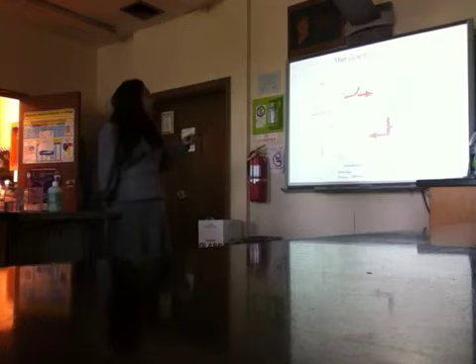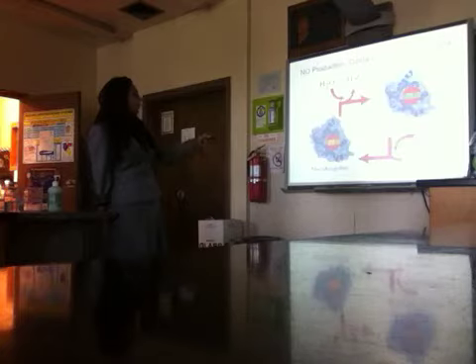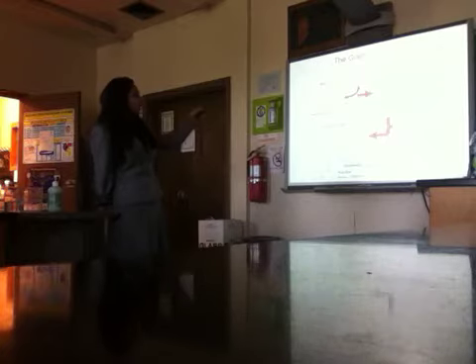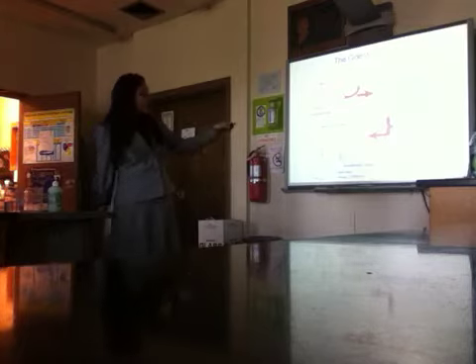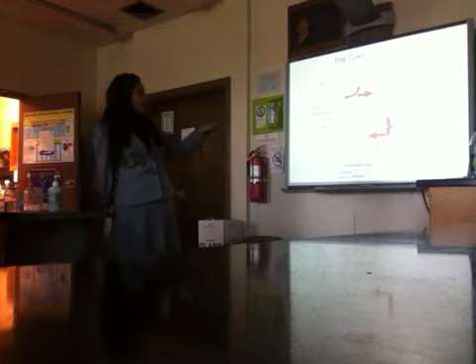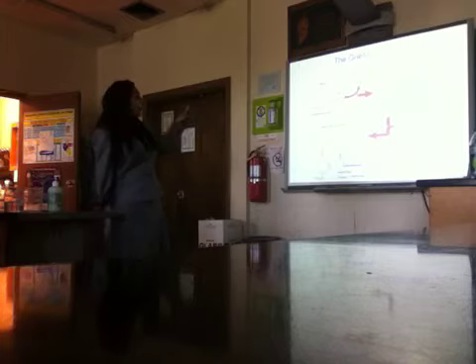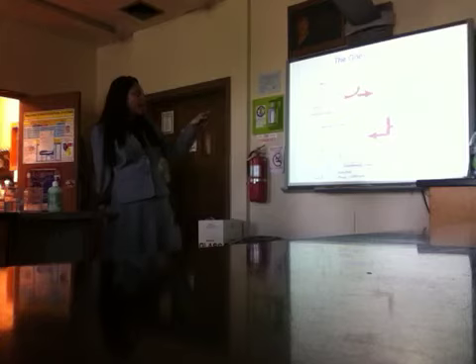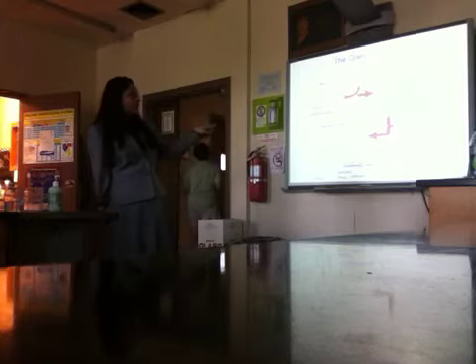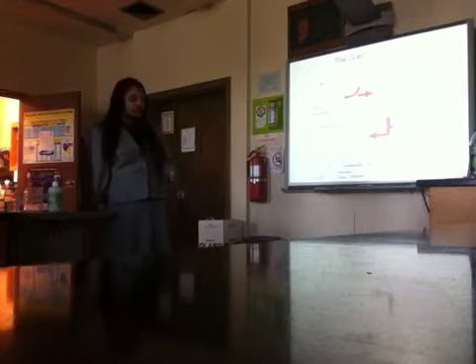This is the Griess reaction to determine the oxidation product, which is nitrite. Sulfanilamide is solution A of the Griess reagent, and NEDD, which is N-1-naphthyl ethylenediamine dihydrochloride, is solution B of the Griess reagent. When nitrite reacts with the sulfanilamide, it converts into the diazonium, and then when it reacts with the NEDD, it produces the azo dye, which we can measure at 540 nanometers.